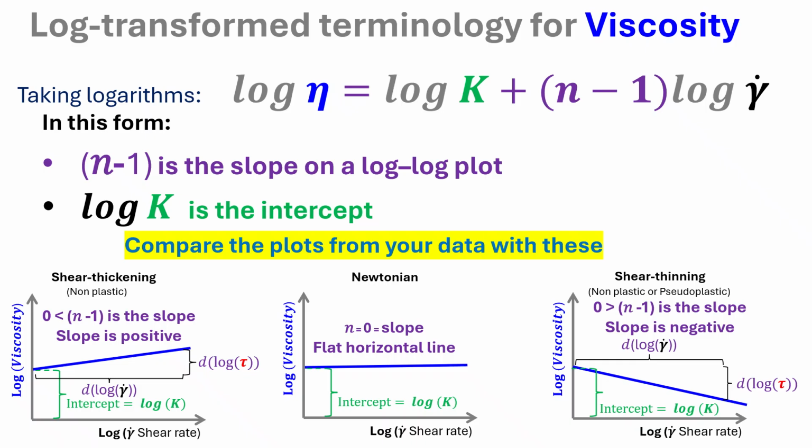So you're seeing that slope go down, and again, the intercept gives you the log value of the consistency index. But like I said, for the viscosity, the slope is actually sloping down. Now, when you get n equal to 1, you simply get a flat horizontal line for this nice simple power law model. So that becomes very straightforward to deal with.